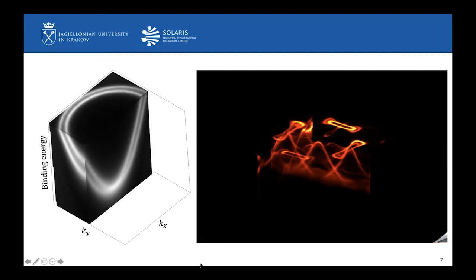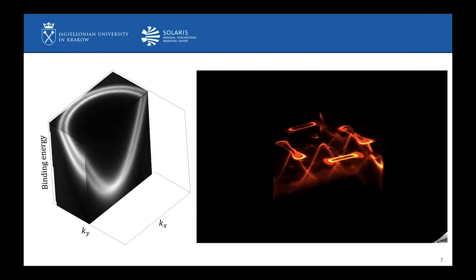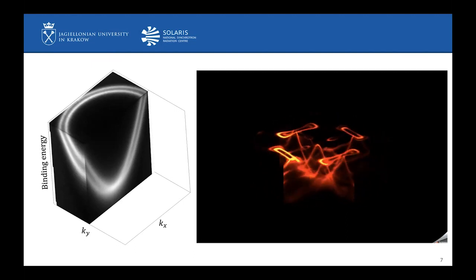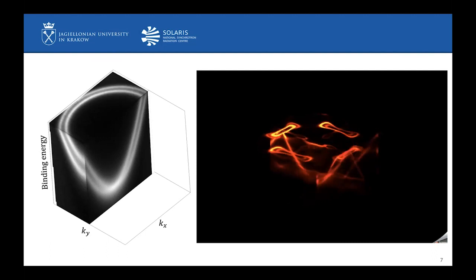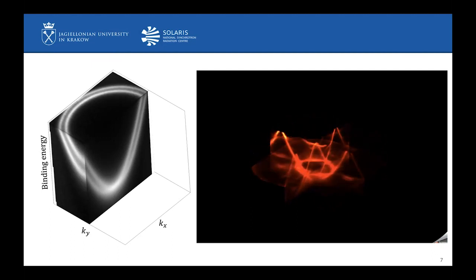So to do that, we have to find a way to look through this three-dimensional data. Okay, I will show you once again this animation, because I think it is easy to imagine this structure thanks to this movie. In here we have the cross section which corresponds to one of the k vectors. Here is the second component of the k vector and the energy.